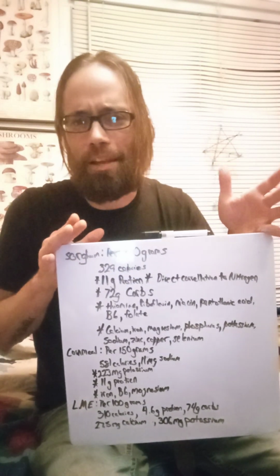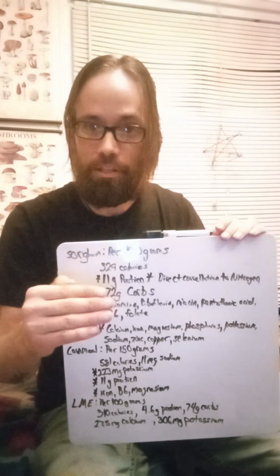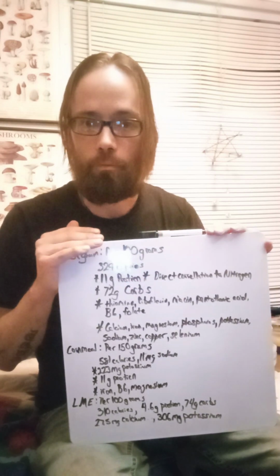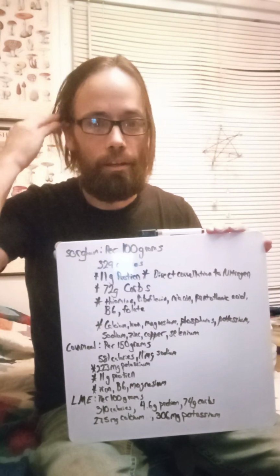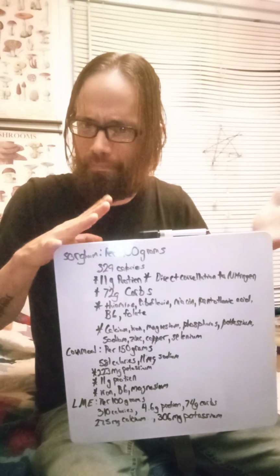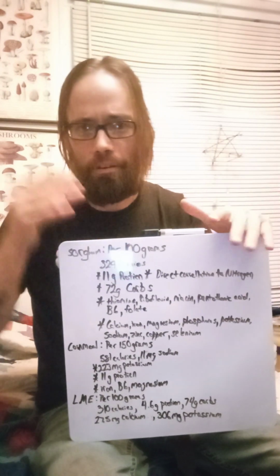what? Maybe I got a bad sleeve of plates. So then, to be sure, I made another batch of that media, the exact same. Poured 20 more plates, 15 of them went bad. And I thought, huh, I don't know what's going on there. I couldn't figure it out.